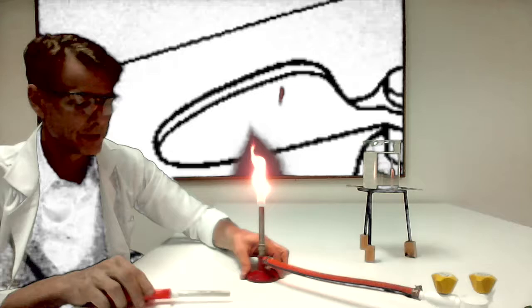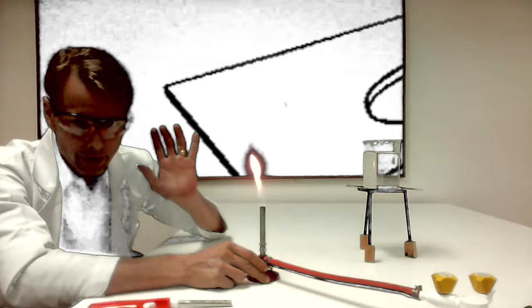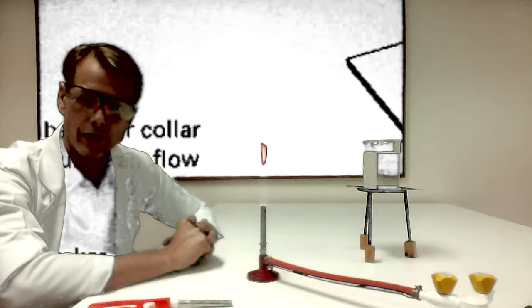Now, we will open the air intake, expose the holes. If you're observing, you can hear a little sound. We have now developed a non-luminous flame. It's not bright. It's not illuminating anything. This would not be a good flashlight.